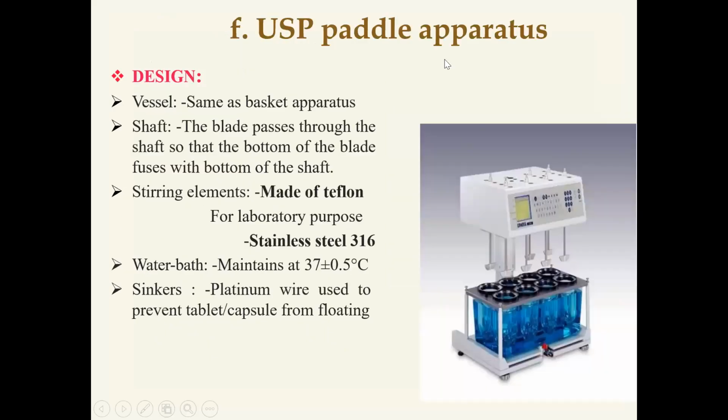Next one is the paddle type of apparatus. Everything is the same as the basket type apparatus. Here the stirring elements are made up of Teflon. The water bath is maintained at 37 plus or minus 0.5 degrees centigrade. In the paddle type of apparatus, sinkers are used to prevent dosage forms from floating.